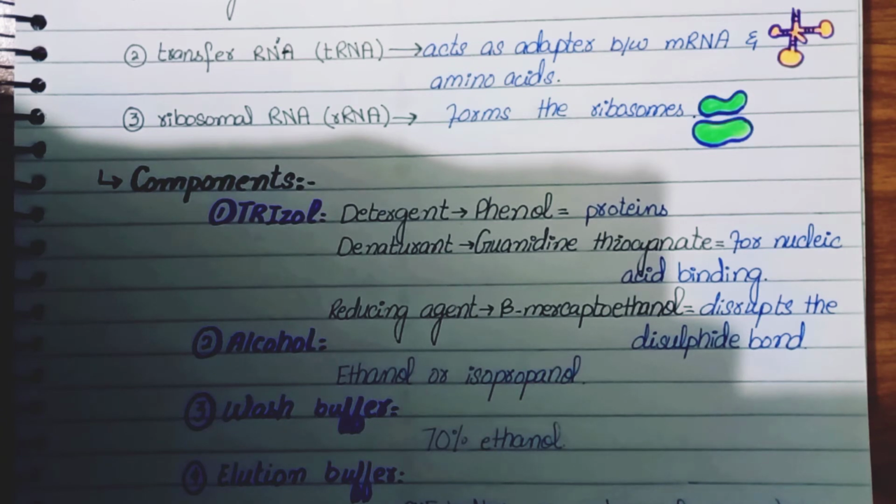For precipitation we need alcohol, either ethanol or isopropanol. Then for washing we use wash buffers, and for elution we use the elution buffer. So here we have the 4 major steps that are required for any nucleic acid extraction, either DNA or RNA extraction. Now let's move to the procedure that is required for RNA extraction.